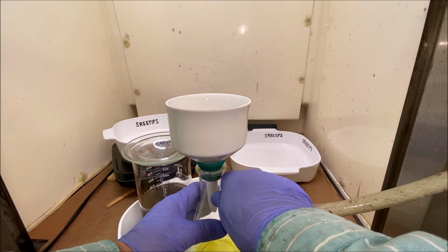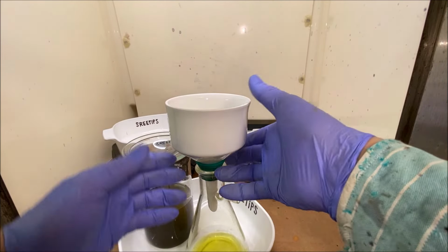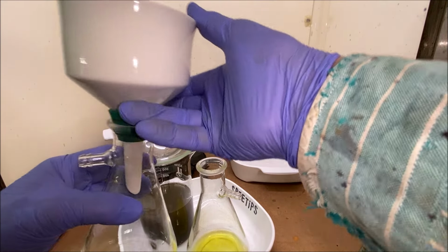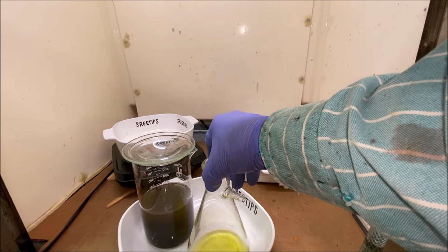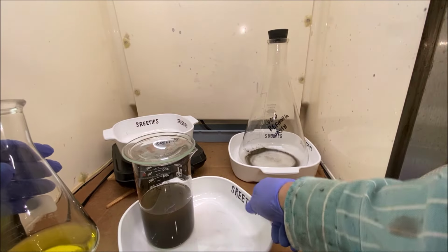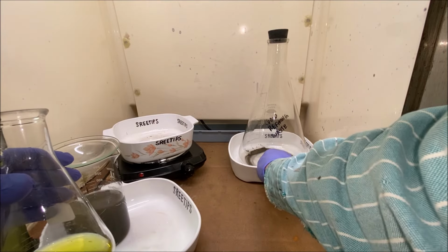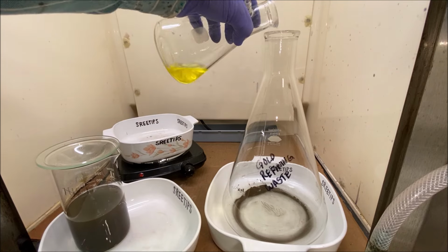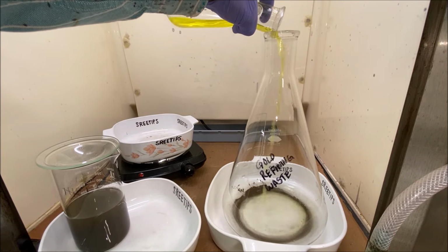Now let's get rid of this funnel here. Take this, just have a little gold in it, and we'll add this to our temporary waste container and save it. We'll recover the gold out of there later on.